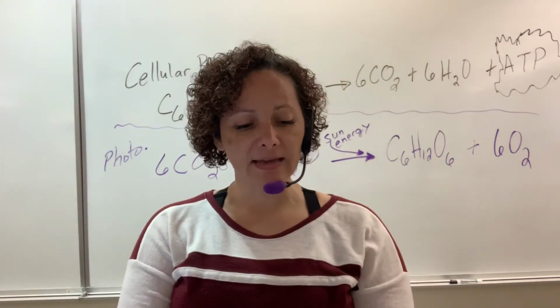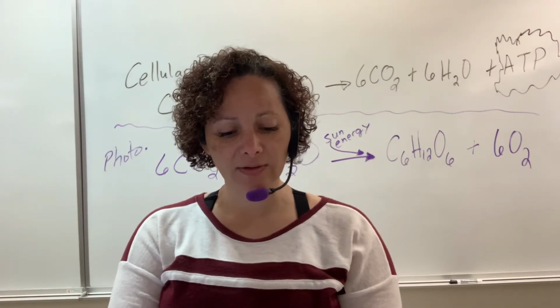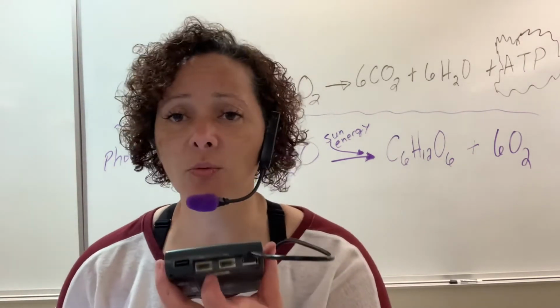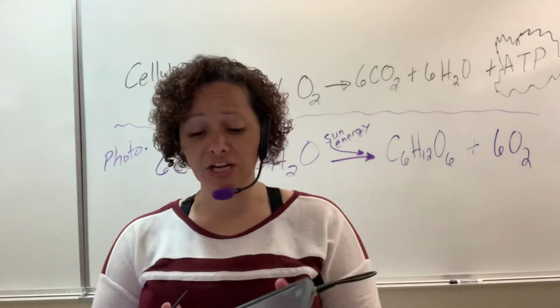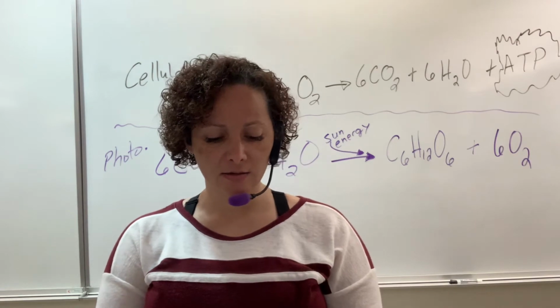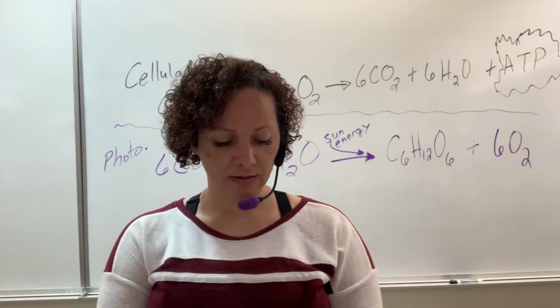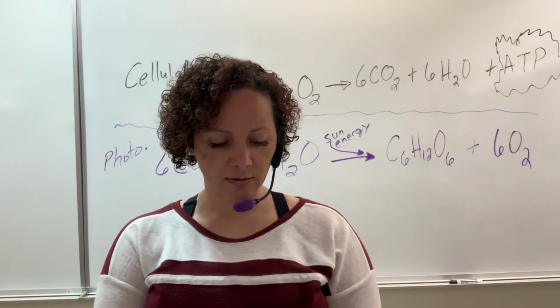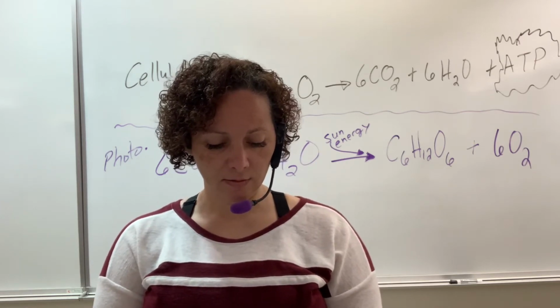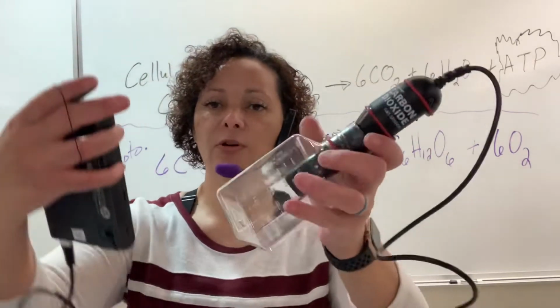So right away, it tells you where to choose. So we're looking at the CO2 gas. It doesn't matter if you're in channel 1, 2, or 3. It'll just choose a channel, okay? Whatever channel you're in, and hit OK. And then we're going to go ahead and calibrate. So in order to calibrate, place these in the chamber.